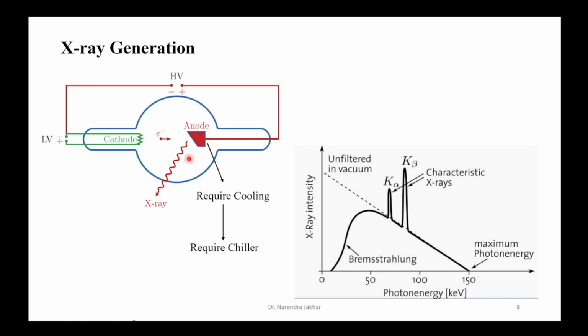This is a very fundamental principle of classical electrodynamics, that accelerated charged particles emit electromagnetic radiations, and X-ray is part of electromagnetic radiations.